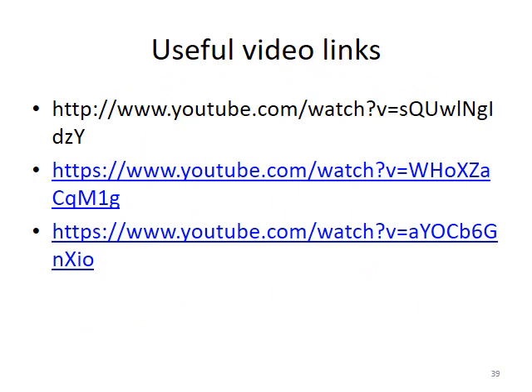I have added a few websites here. These videos may help you gain a deeper understanding of how mass spectrometer works, how QTOF achieves sensitivity and resolution.